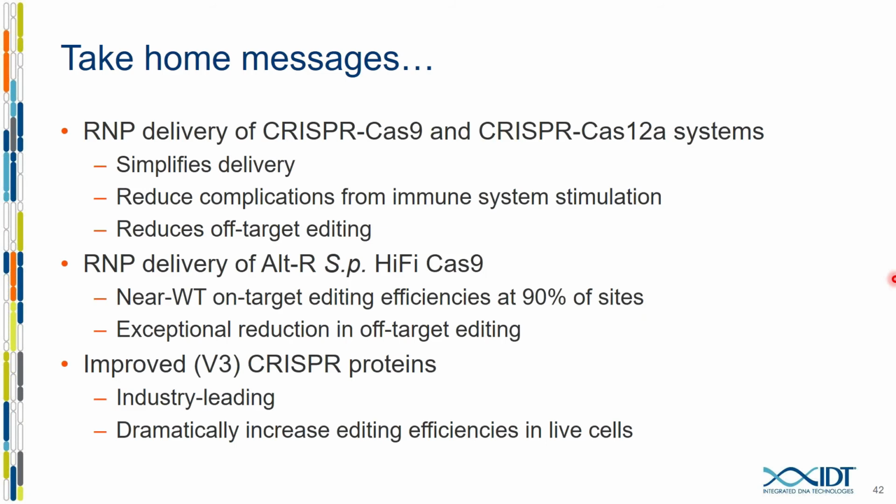I do know there are reports of people getting fluorescent proteins in. I've never seen anybody get an RNP in. That's something we've talked about trying to get to work. But no, I just don't know the answer to it. I don't know if anybody's done it yet. Right.